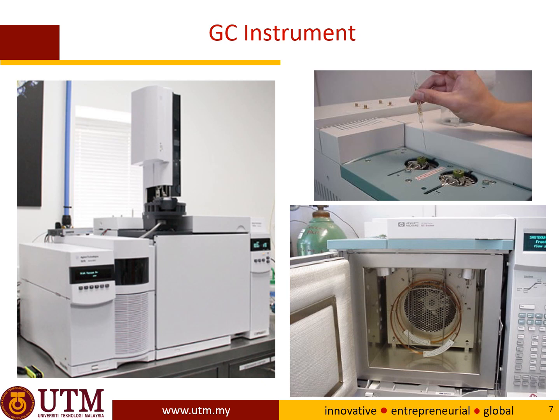This is the common GC instrument. This is an Agilent. This is the manual injection, by using a syringe. But in industry, most of them are using an auto sampler already. This manual injection has its drawbacks as well, because it depends on the mechanics of your hand. If the injection is not repeatable or not reproducible, your analyte results will have problems as well.